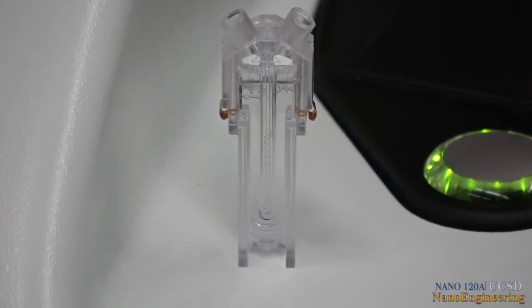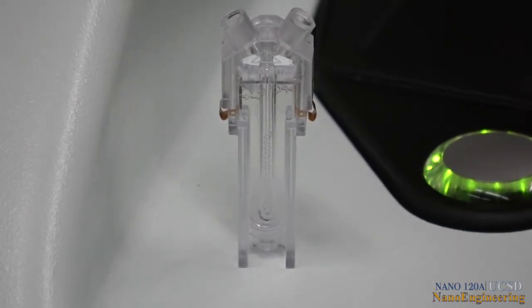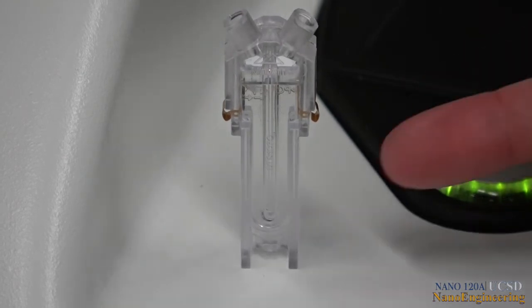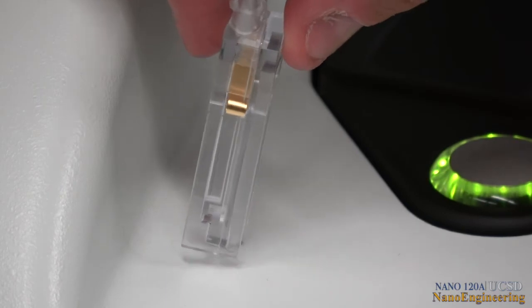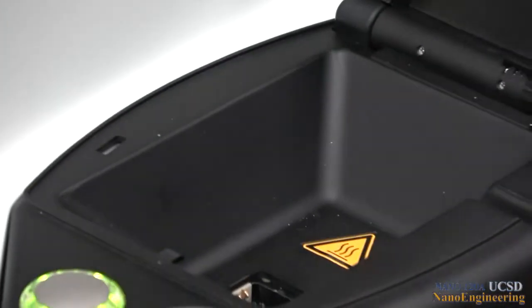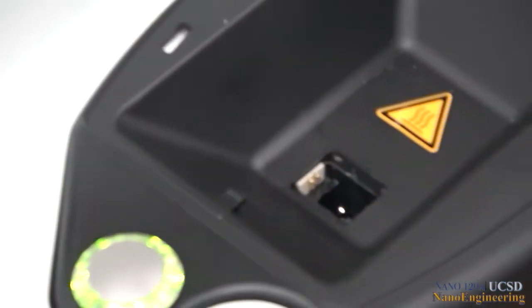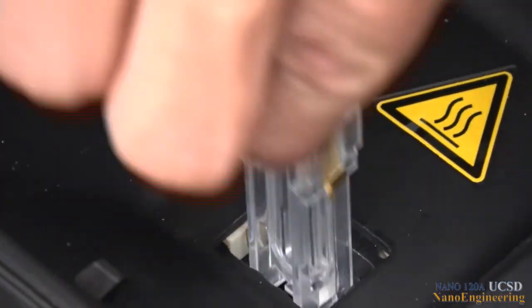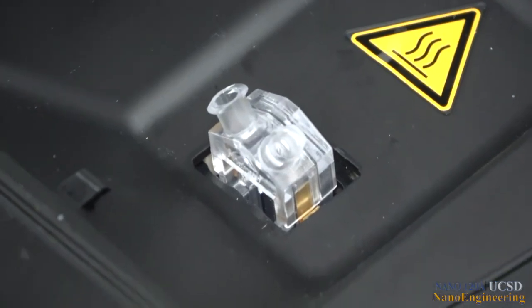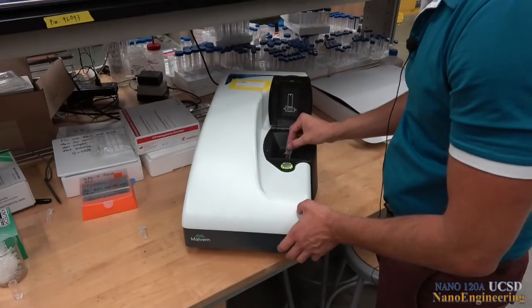Okay, so now we're going to move on to a Zeta potential measurement. And so here's the sample holder that we talked about earlier. So you can appreciate, again, it's this little U-shaped cell, and it has these electrodes on either side. You can then see when you go into the instrument that it does have the coupling where it couples with those electrodes to put potential across. So that just is seated down there properly.